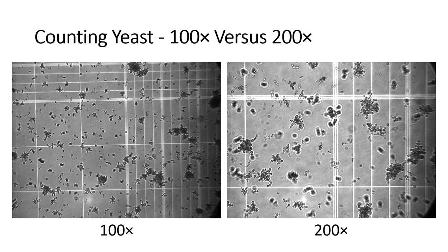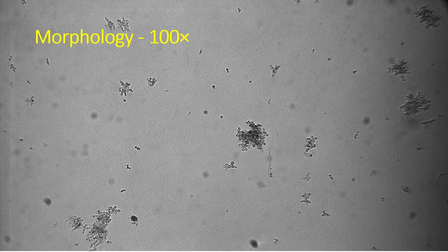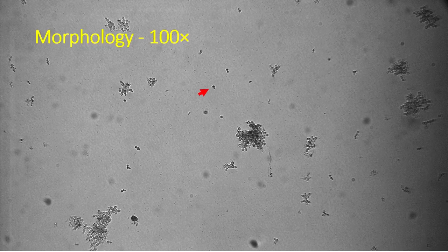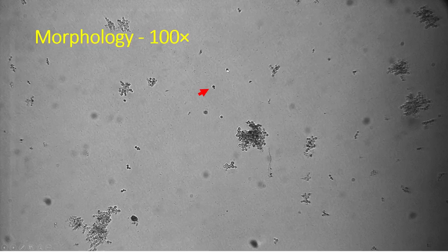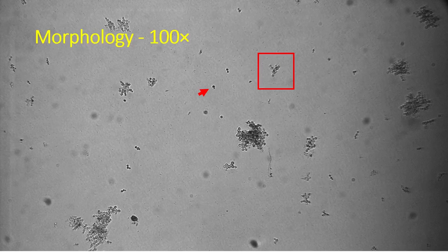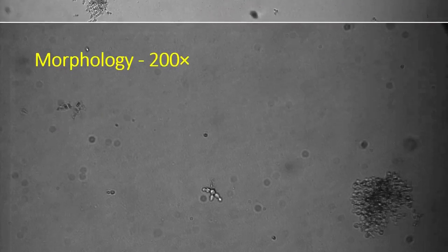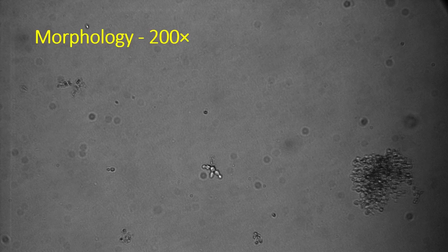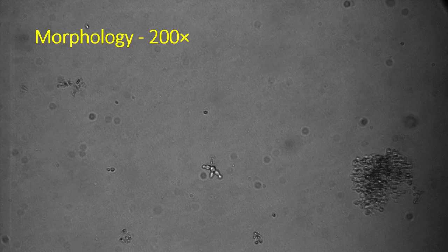But what if you want to start looking at morphology? At 100x we're looking at a field of yeast, and it's hard to tell yeast shapes apart. Here we have a yeast that is clearly budding, but in other cases it's not clear if this is two yeast stuck together or a yeast undergoing budding. For the rest of these images, I'm increasing the magnification of my microscope but keeping this cluster in the box in focus. If we zoom into 200x — a 20x objective and 10x ocular — we can start to see a little bit more detail, but really not enough to say anything about morphology.